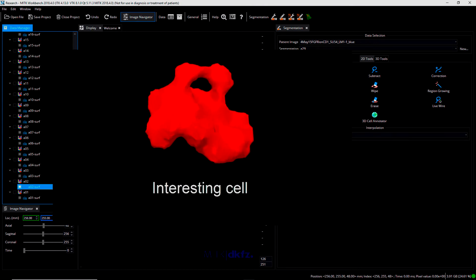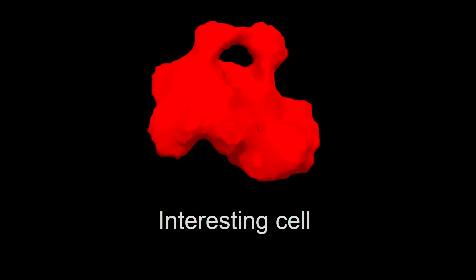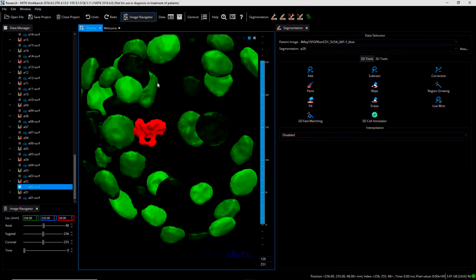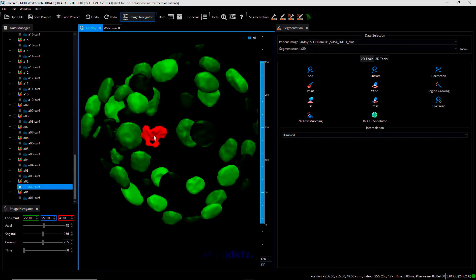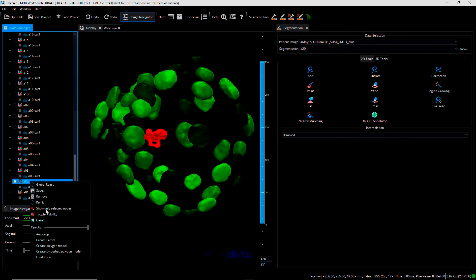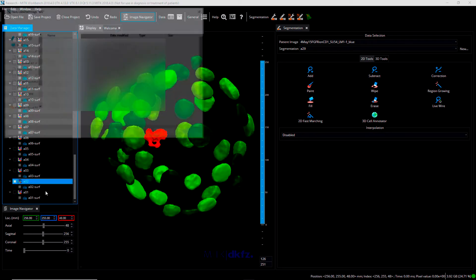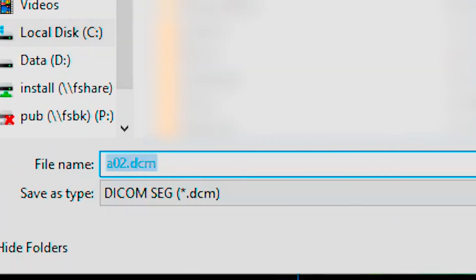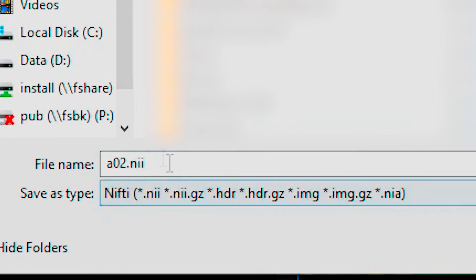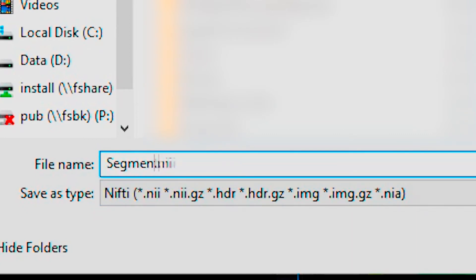For example, this cell is probably approaching an apoptotic stage. You can then export the binary stacks of selected cells to proceed with their analysis, for instance to extract morphological features.